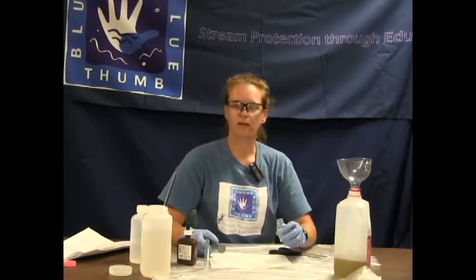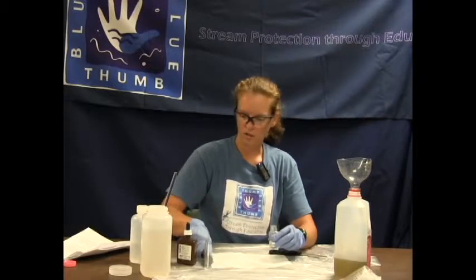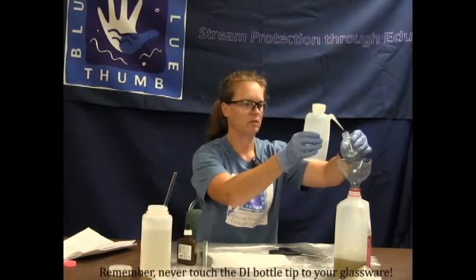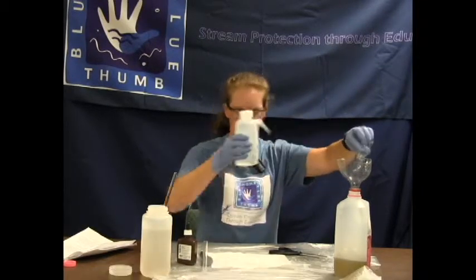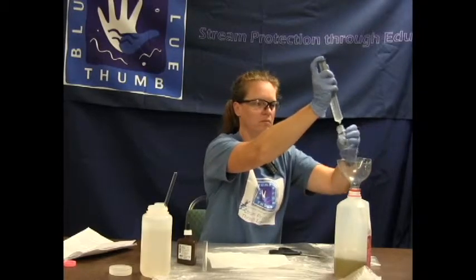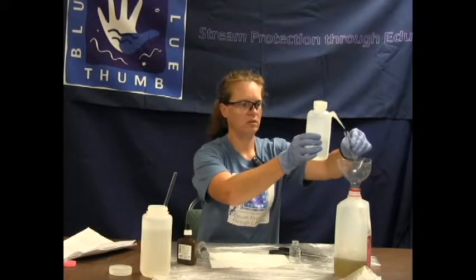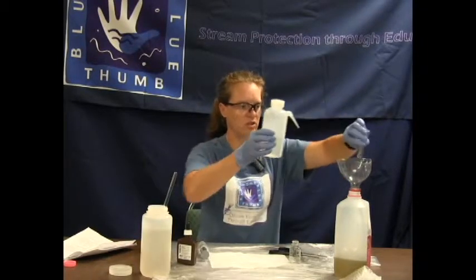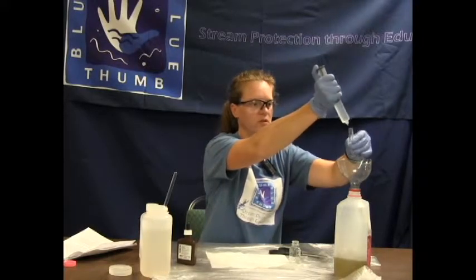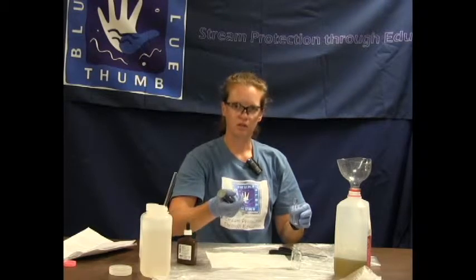This is the high range chloride test. If the solution didn't change at the 20th drop, then you need to go to the high range test. This is where we will utilize the small measuring tube. We need to rinse out the square mixing bottle with deionized water and also with creek water. Do the same with the plastic measuring tube. You only do this high range test if your solution did not change color at the 20th drop of the silver nitrate. This uses a lesser amount of sample because there was so much chloride in the water.